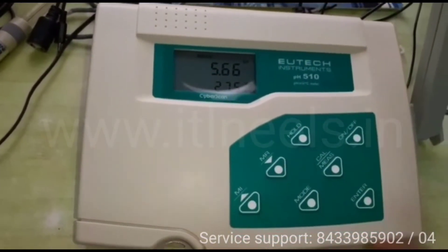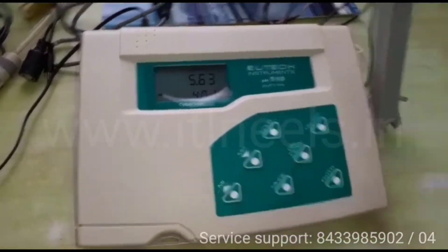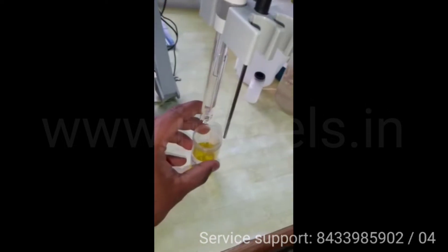You can calibrate the meter up to 5 points. For calibrating the meter you have to press the cal/measure button. Then you have to insert the electrode and ATC probe, and a buffer.